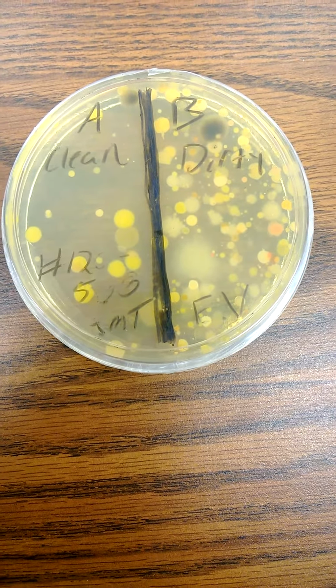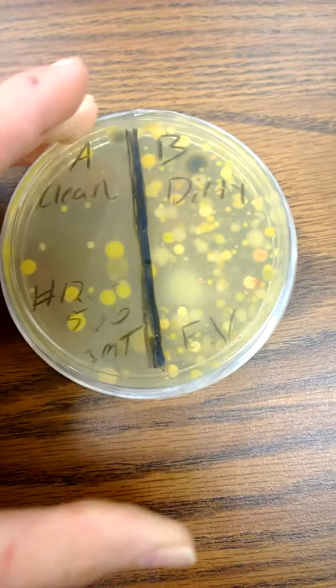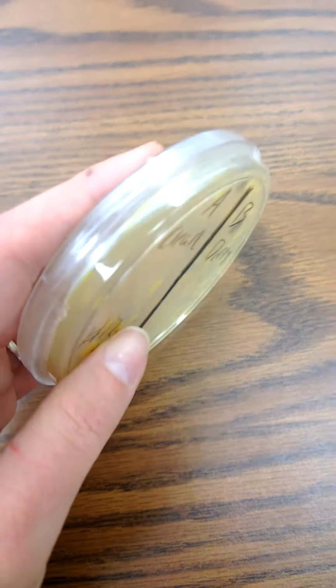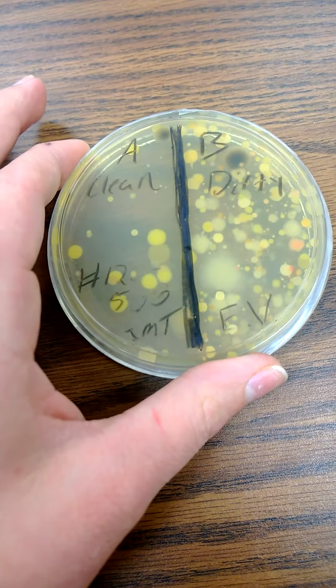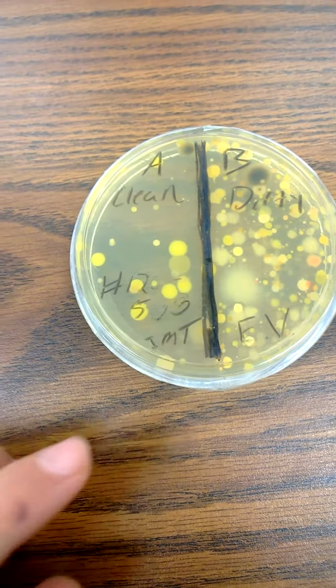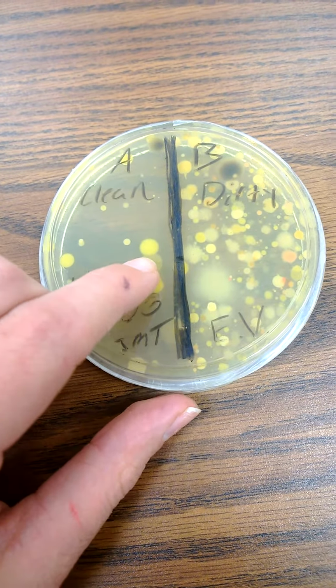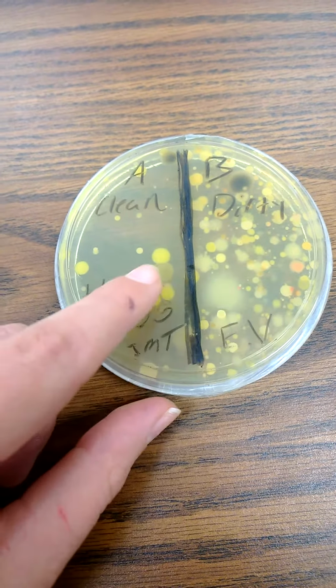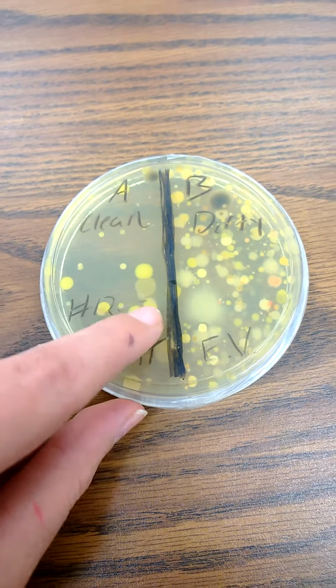Now, you grew these bacteria on agar, which is that yellow substance that you see in your petri dish. That is the medium that provided a food source for your bacteria to grow. So now we can see colonies of bacteria. Each one of these little dots has many bacteria in each colony.